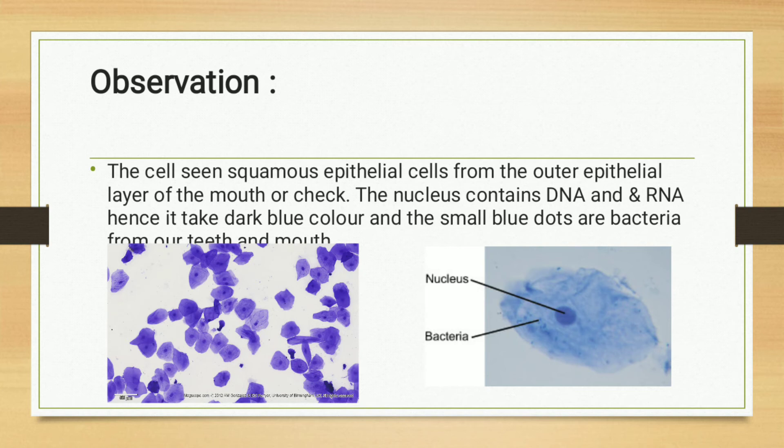The nucleus contains DNA and RNA, hence it takes dark blue color. The small blue dots are the bacteria from our teeth and mouth.